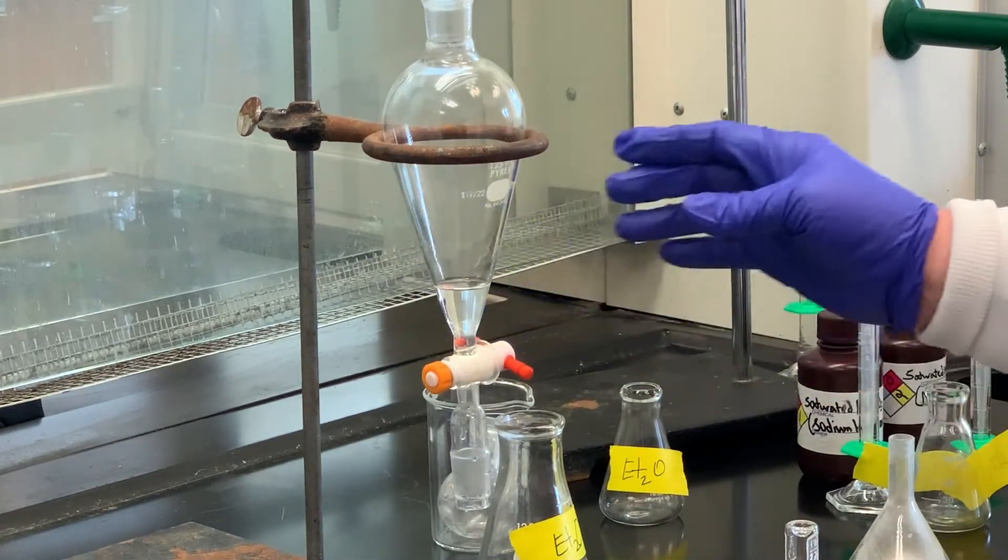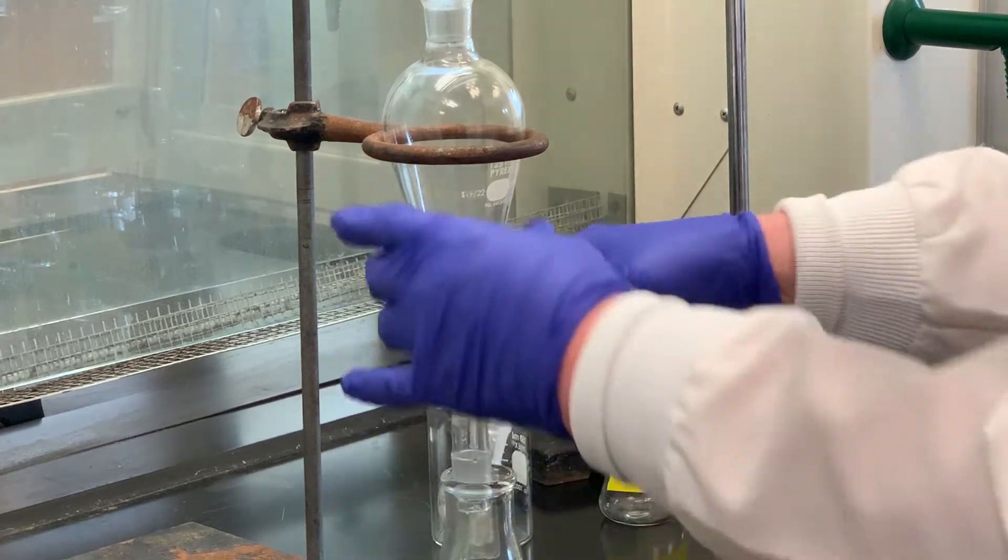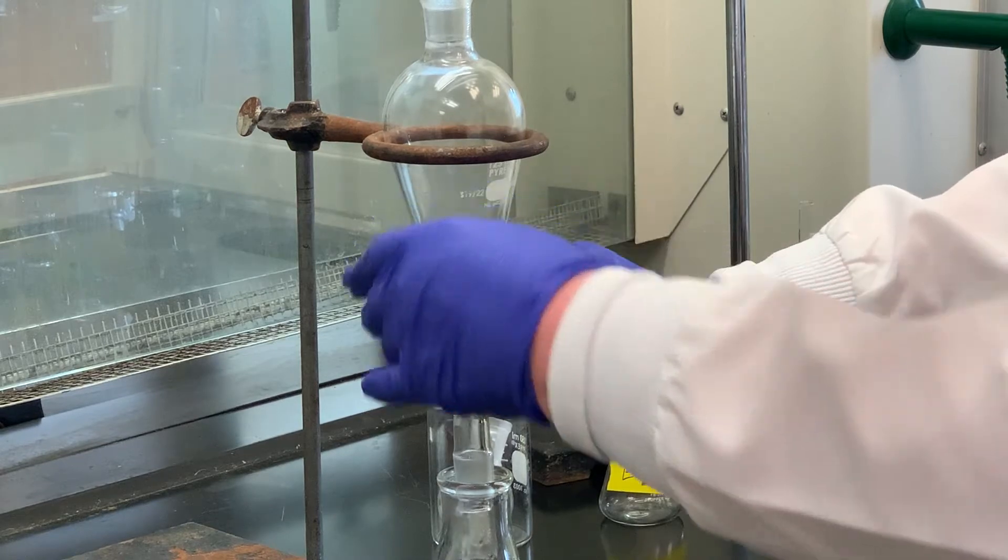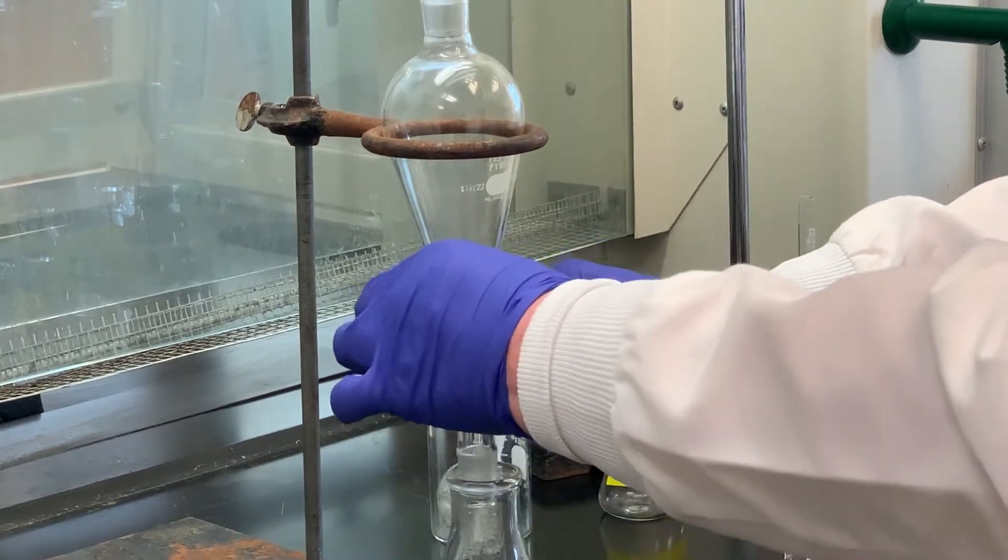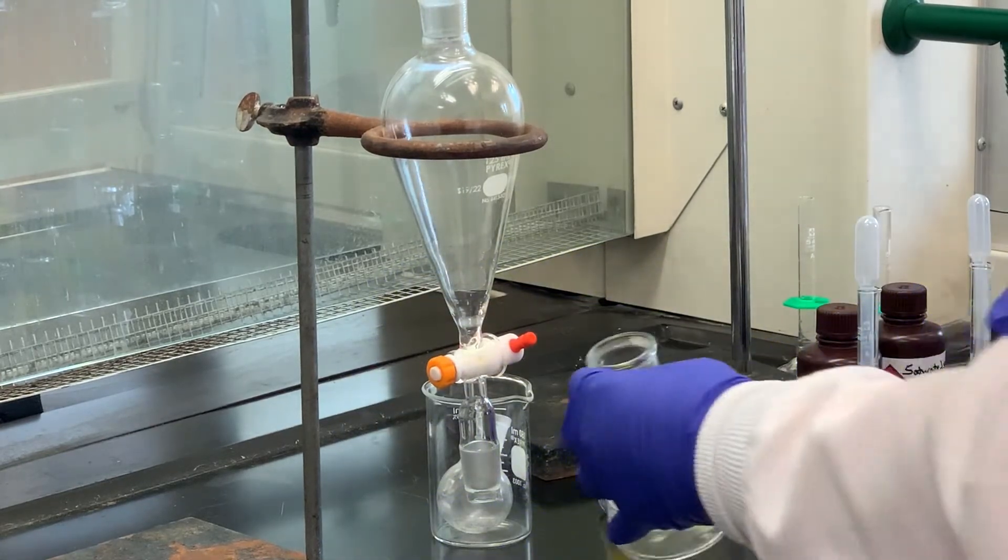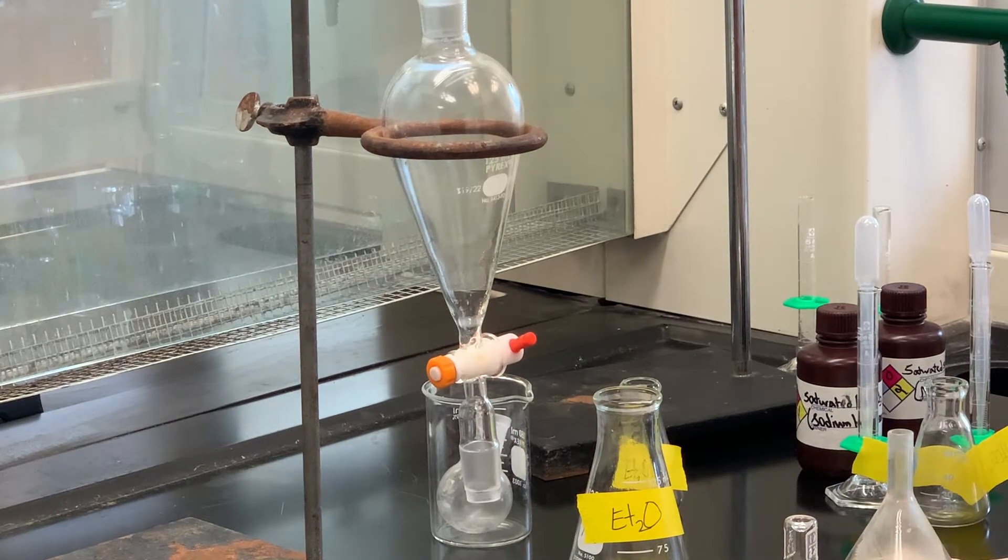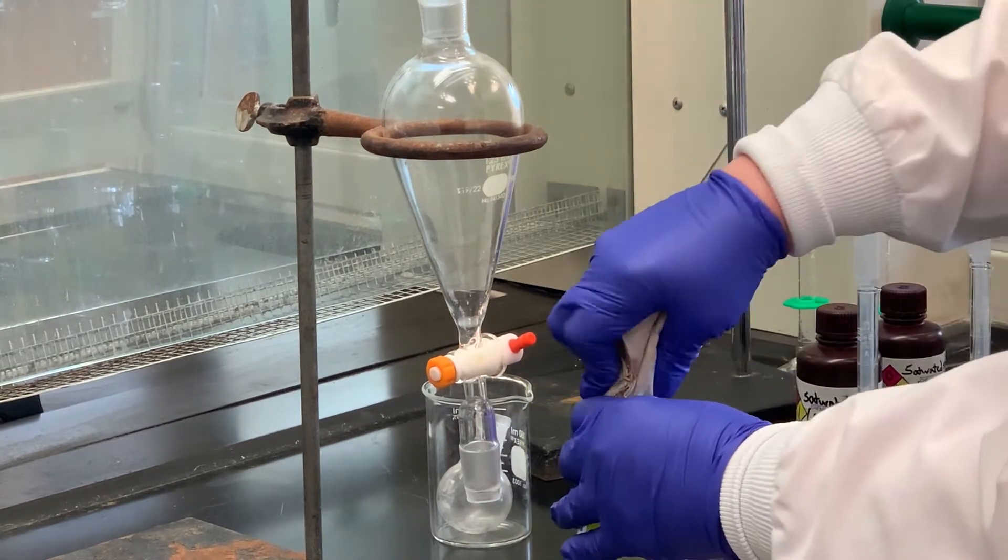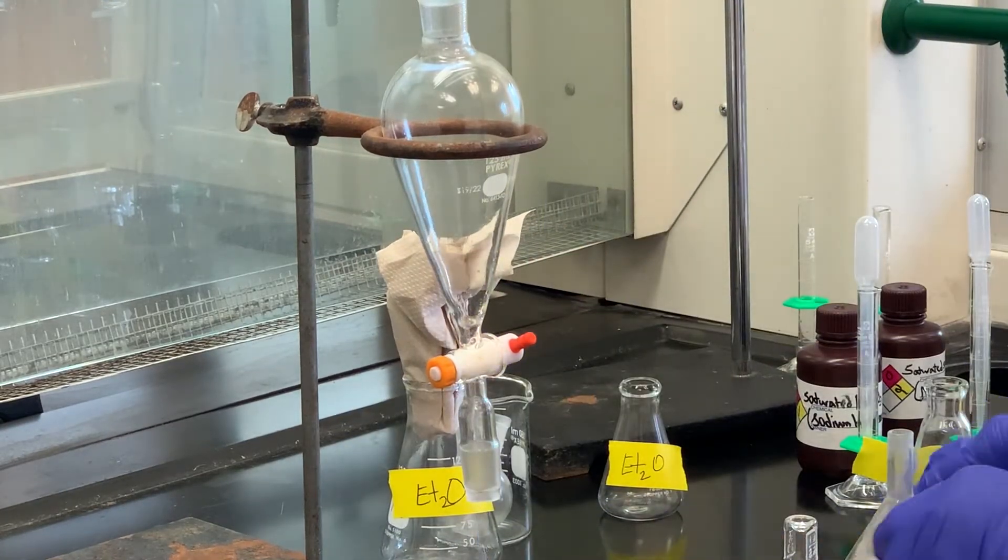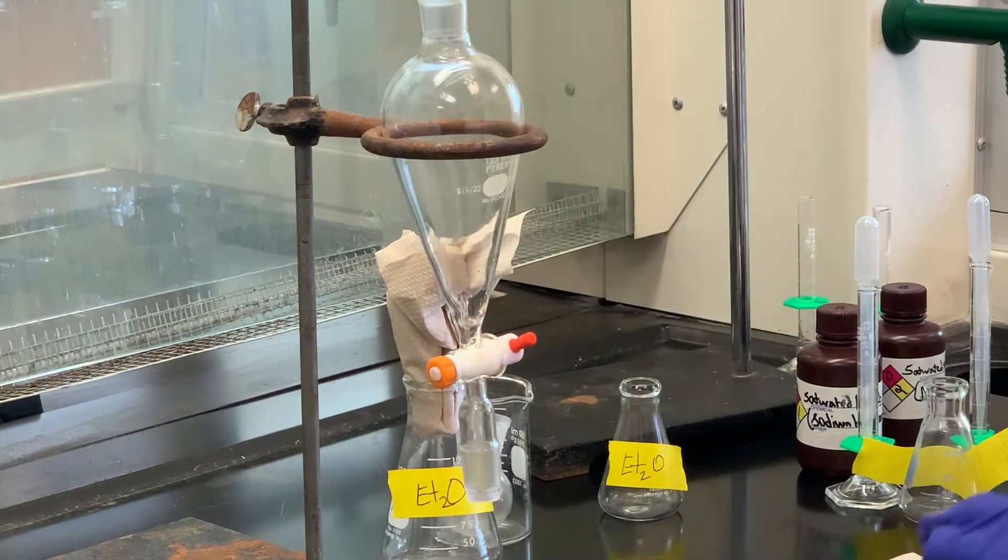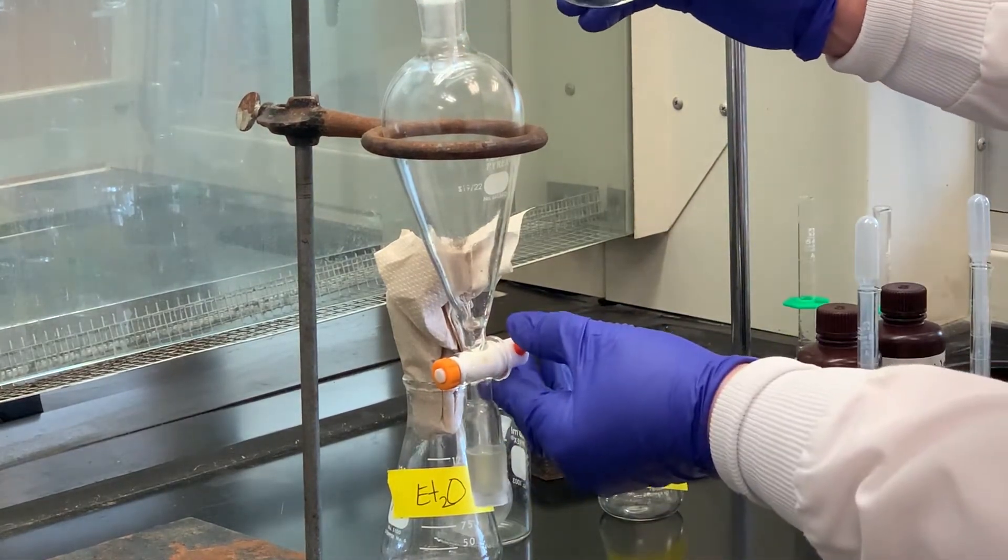So that is our aqueous layer. I've just labeled this the ether. I'm going to combine all my ether extracts at the end. So I'm just going to go ahead and drain this off. And since ether is fairly volatile, it's always a good idea just to stopper that with some paper towel so we're not evaporating everything that we worked so hard to get. So I'm going to pour the aqueous back into the separatory funnel. Stopcock is closed.